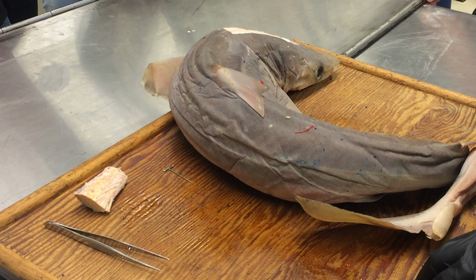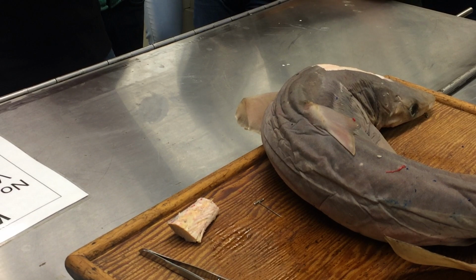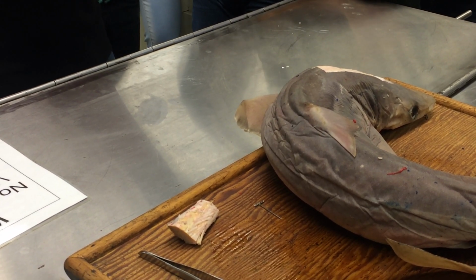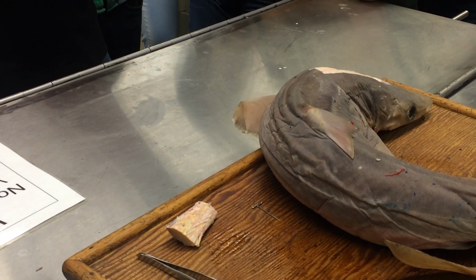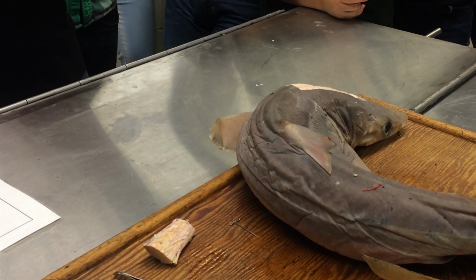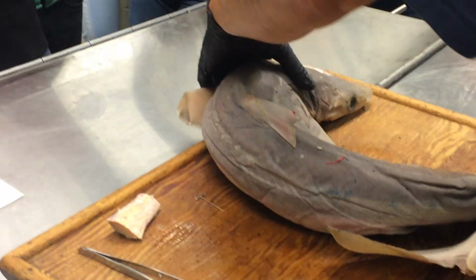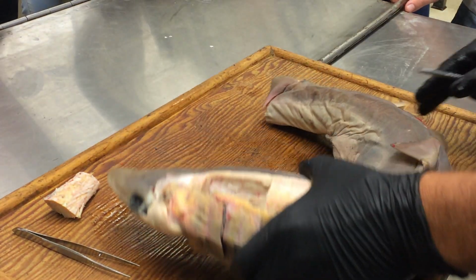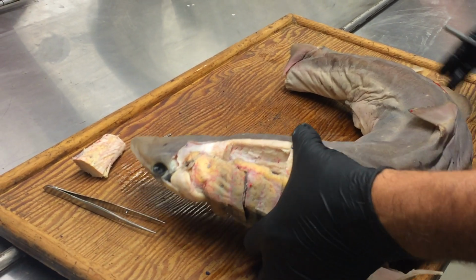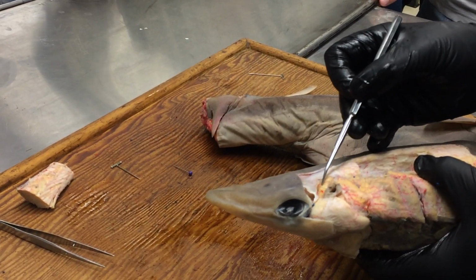But Jack brings up an important point. We've got an adductor mandibuli that closes the jaws. How do the jaws open? Coracomandibular, exactly. It's these hypobranchial muscles that pull back on the lower jaw and open it. So there is no muscle called abductor. There is actually, we'll see when we get to tetrapods, a new muscle that appears called depressor mandibuli that opens them out. And we actually have a variant of that ourselves. Okay, so that's levator palatal quadrati.